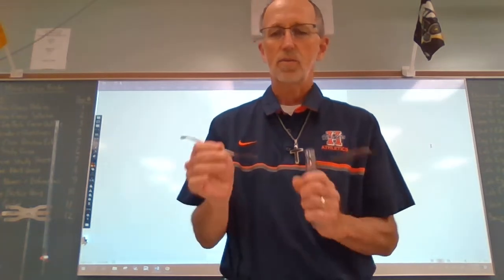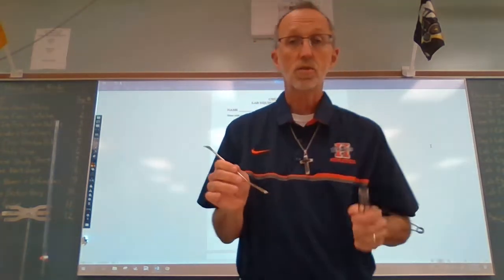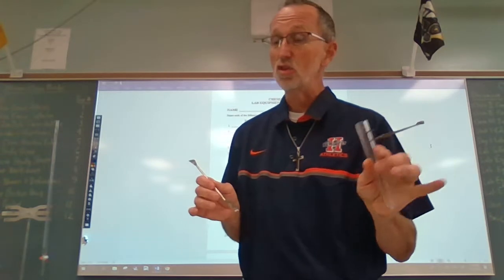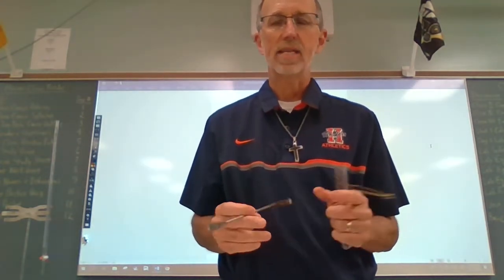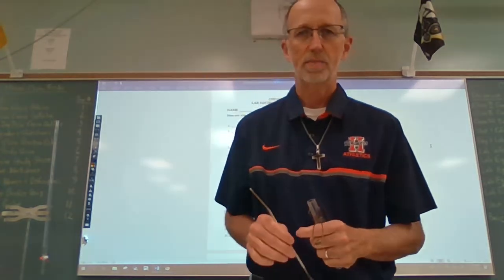All right. So really, this narrow end is to transfer solid chemicals into a test tube or something that's got a narrow opening. Other than that, like I said, 9 times out of 10, you'll be using the bigger end. Okay.